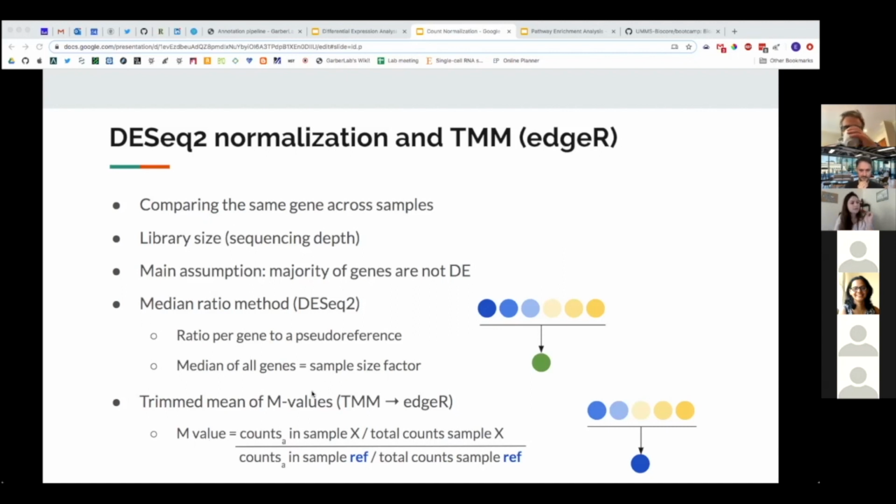All of this is to avoid cases where you have a dramatic change in a few genes from your experiment to your treated control or something like that. For example, in the LPS stimulation of dendritic cells, we see genes that go from having 0 TPMs to having 3,000 TPMs. So that gene is now becoming a significant fraction of your total reads.